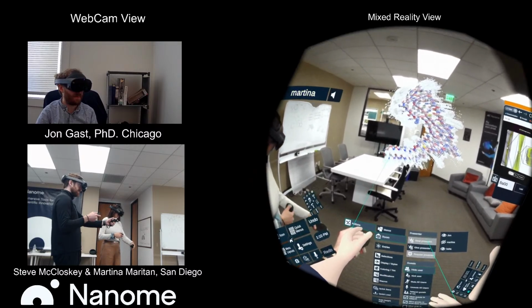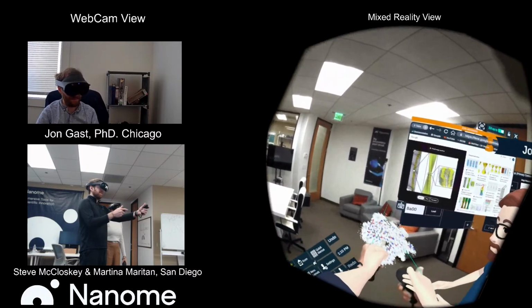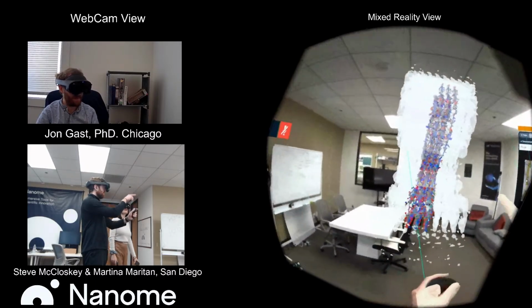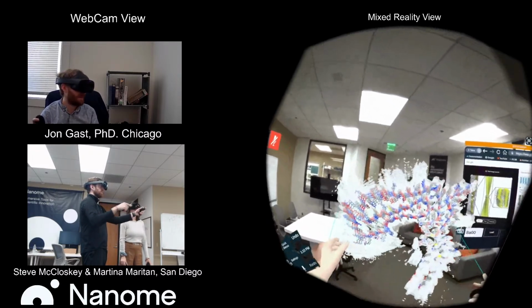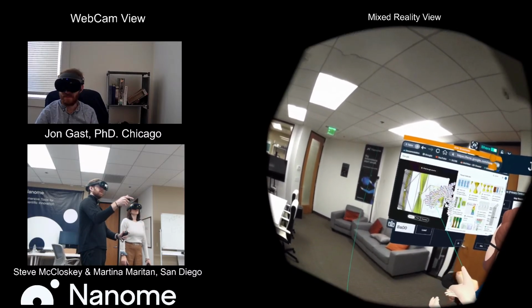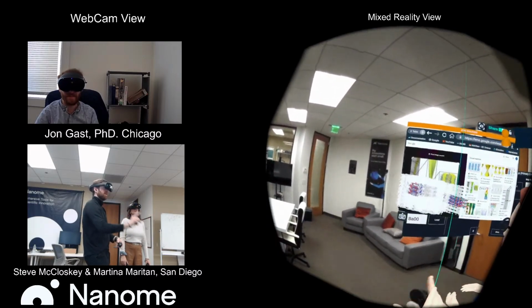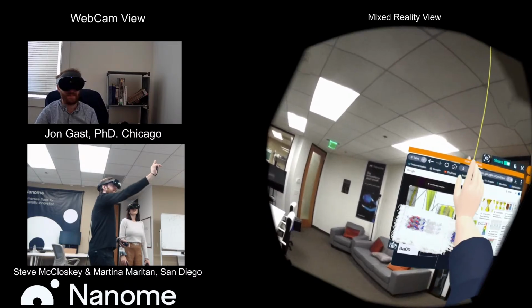Just to take a step back here, the graphic that you showed: you have each of these proteins here, all aggregated into this stack that's relatively planar. And this stack, if you look at the cross section, builds itself into a larger tendril, so you'd have a big stack of these, really elongated.